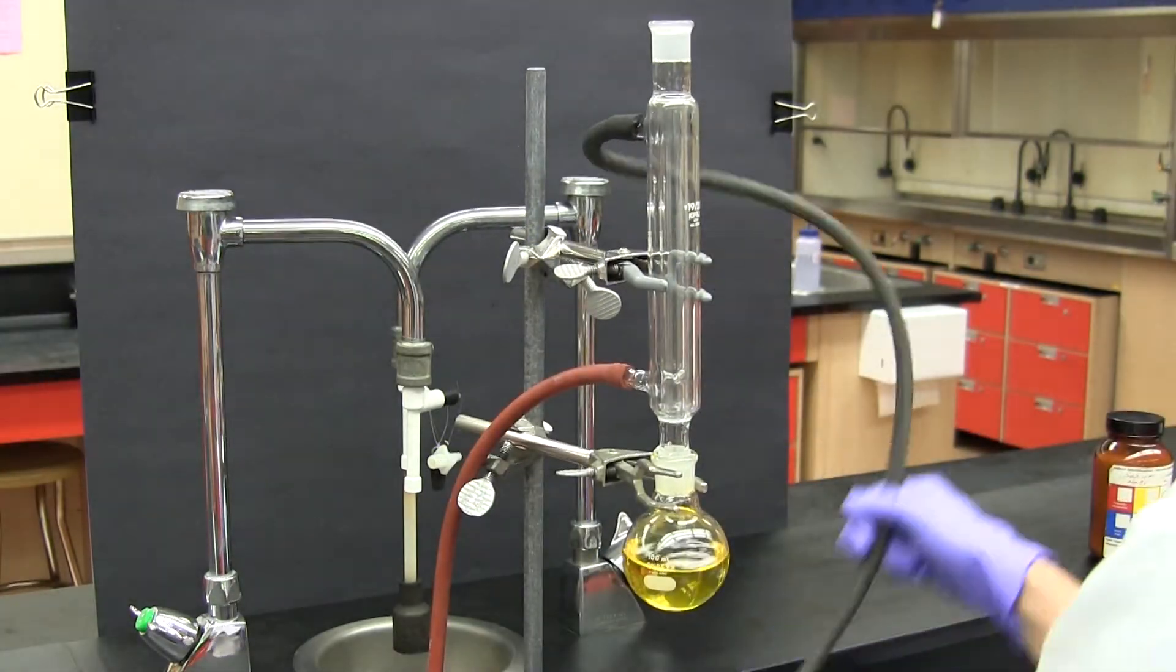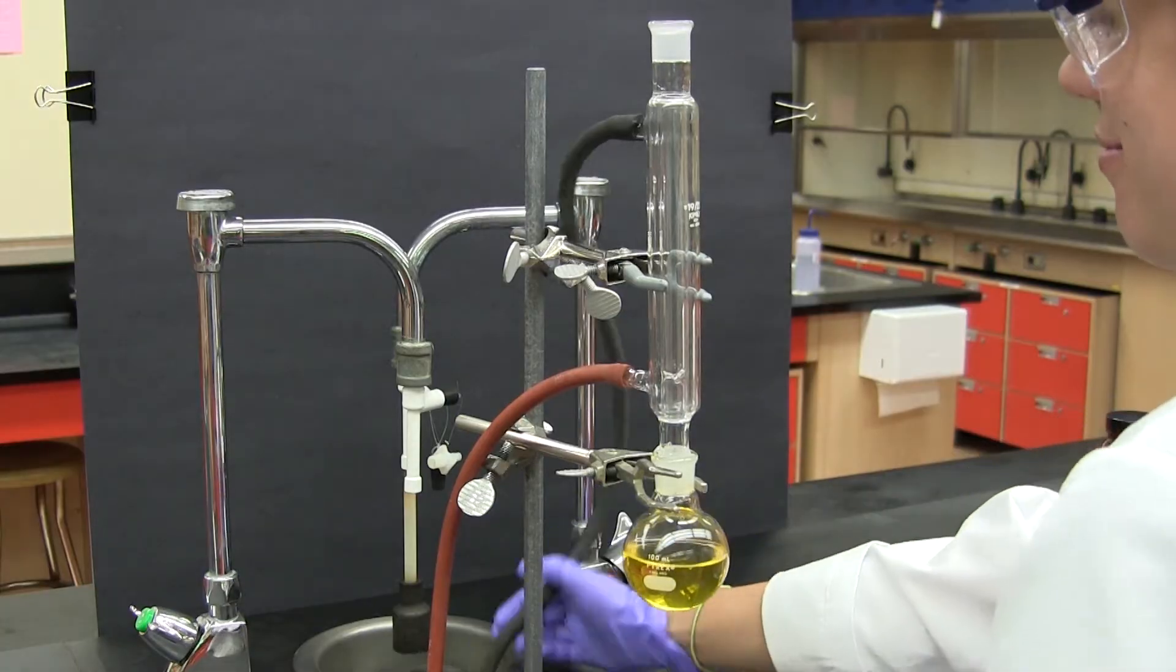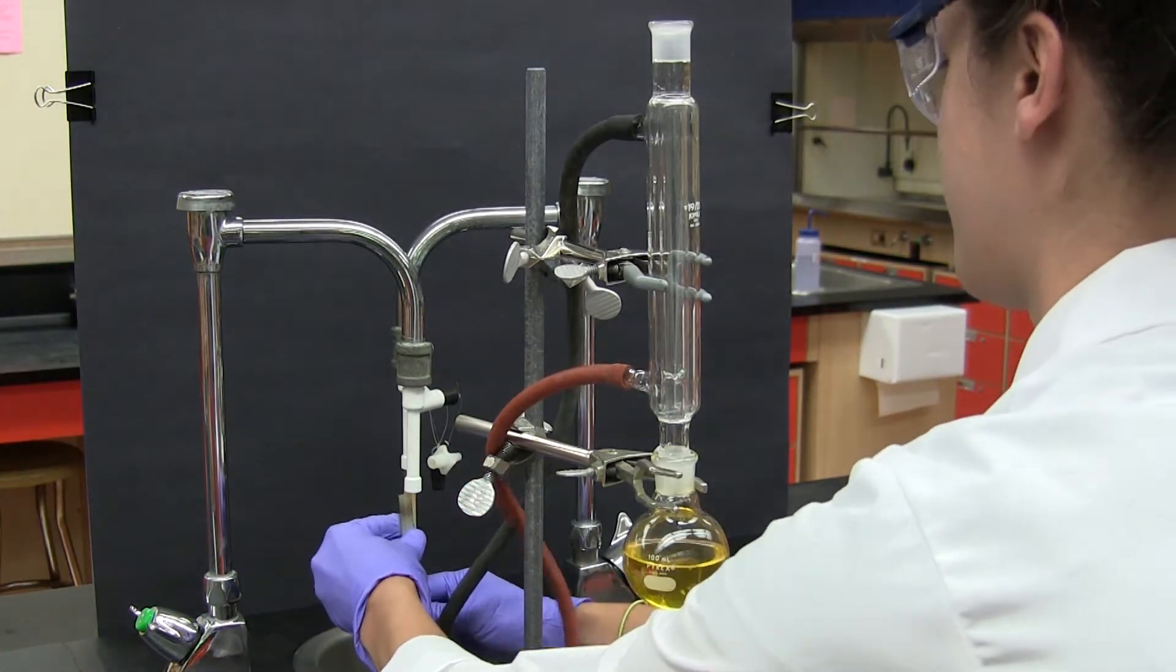The tubing from the top port of the condenser is directed toward the drain and the bottom port is attached with tubing to the water supply.